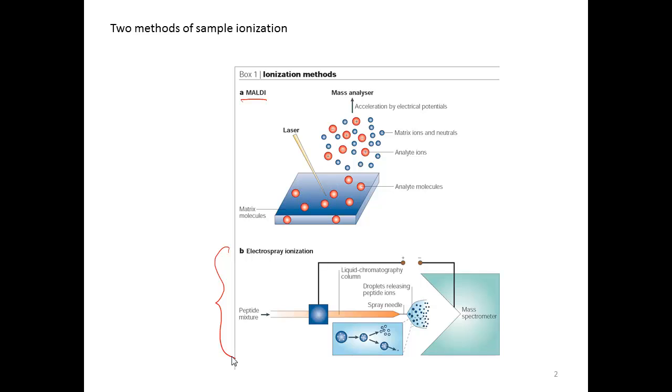Furthermore, these peptides are rather fragile. Methods that are too harsh in terms of vaporizing them will likely destroy them also, and so preclude any real analysis of the peptides. Therefore, the methods were limited for a very long time until these two methods came along for getting peptides effectively in the gas phase.